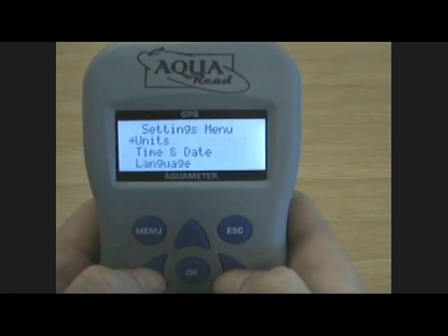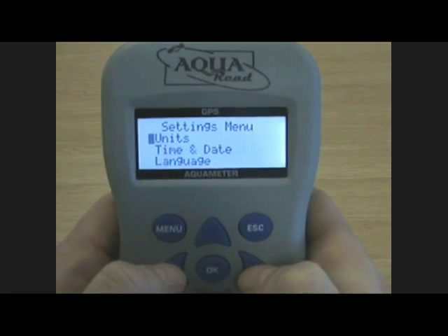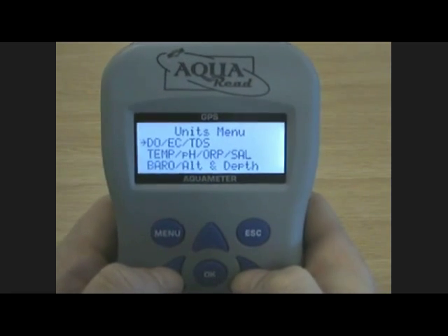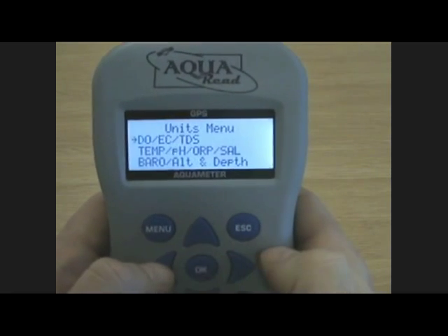Within the settings options, you can change the units, the time and date and the language. For example, if we wish to change the DO units from milligrams per litre to percent saturation, it's that easy.